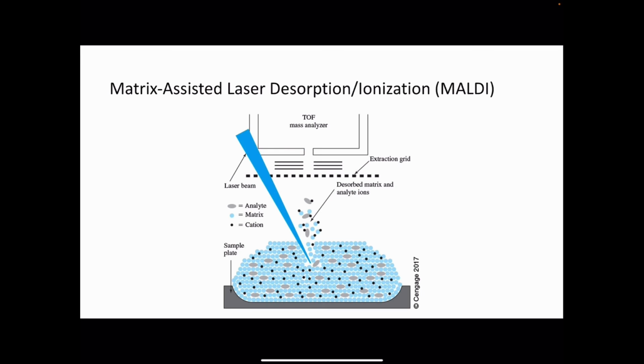So next up is MALDI, or matrix-assisted laser desorption ionization. This desorption ionization method is good for thermally delicate samples, for example, biochemical species and species with molecular masses greater than 100,000 Daltons. So a much wider range of molecules are able to be probed using this technique. And it can also obtain accurate molecular mass information since the spectra only contain the molecular ion peak.